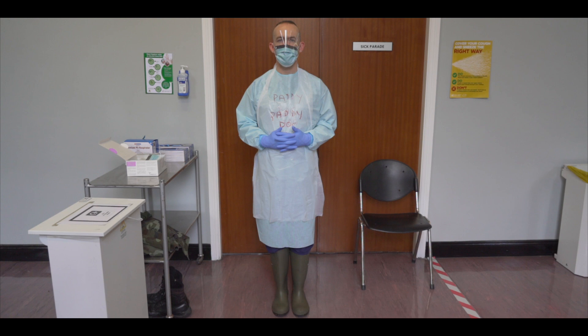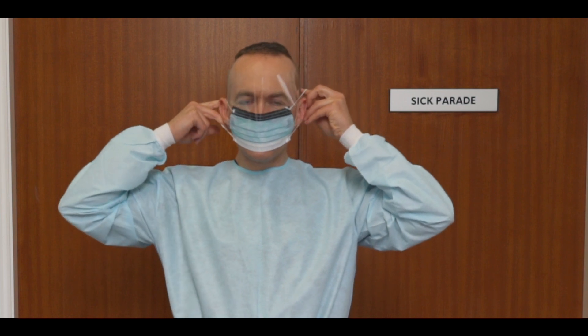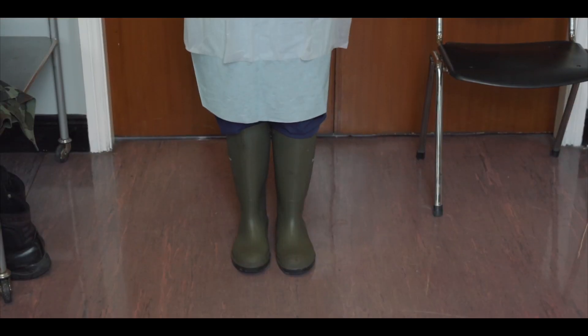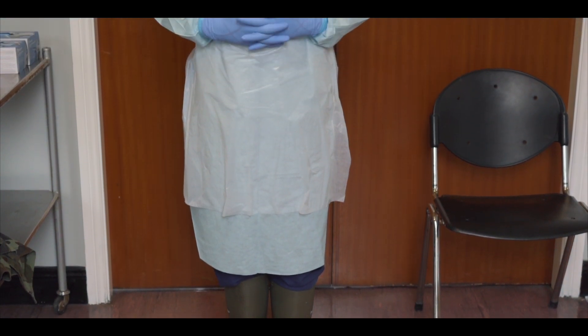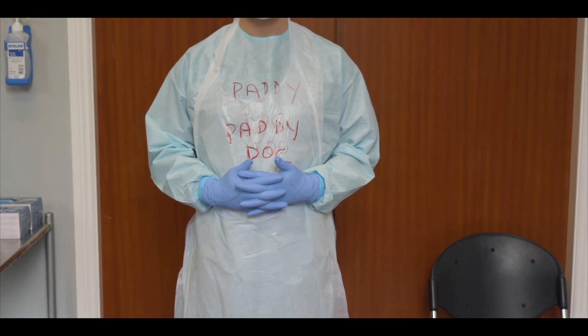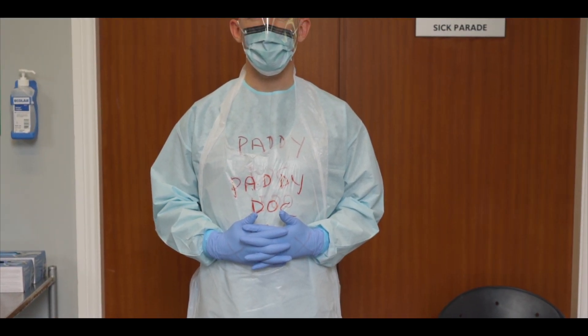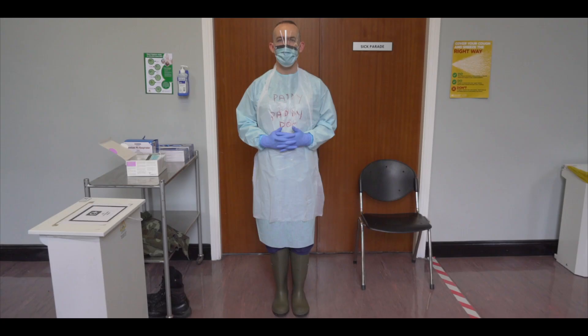The purpose of this video is to demonstrate how to don Defence Force's personal protective equipment at level 3. This video will demonstrate the use of PPE including a Type 2R face mask with integrated visor and ear loops. This level of PPE will protect the wearer from droplet transmission, but not from medical procedures which cause the virus to aerosolise, such as CPR or intubation. This level of PPE is suitable for use when conducting nasopharyngeal swabbing for COVID-19.